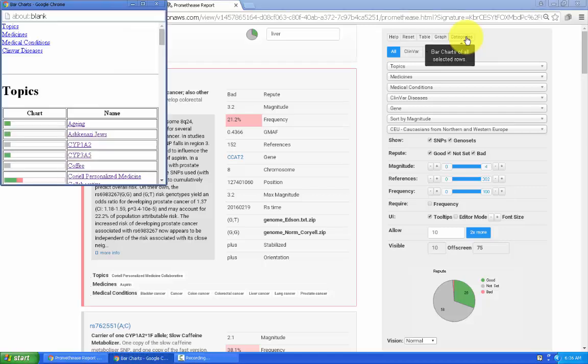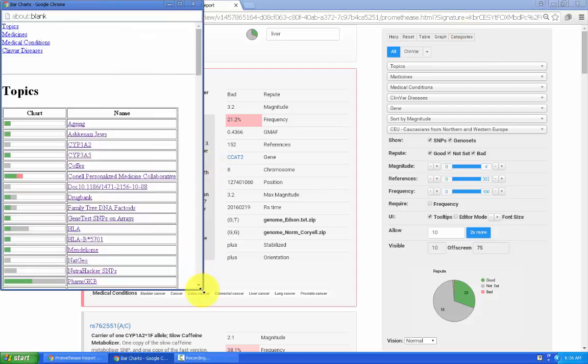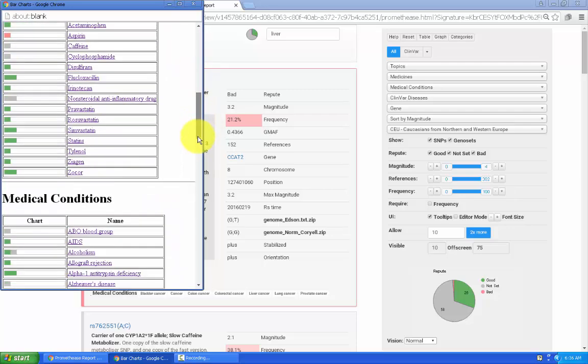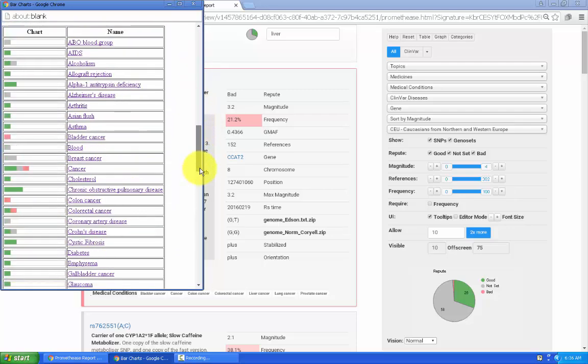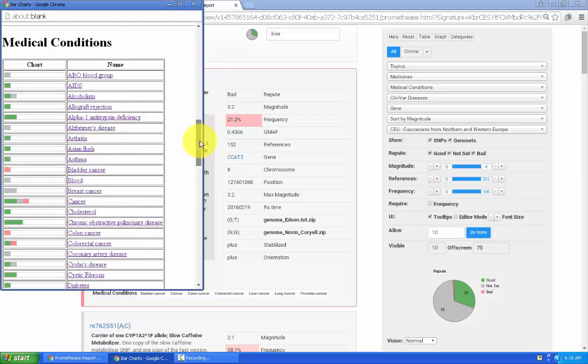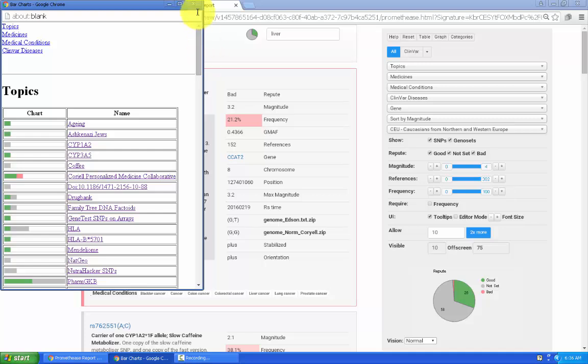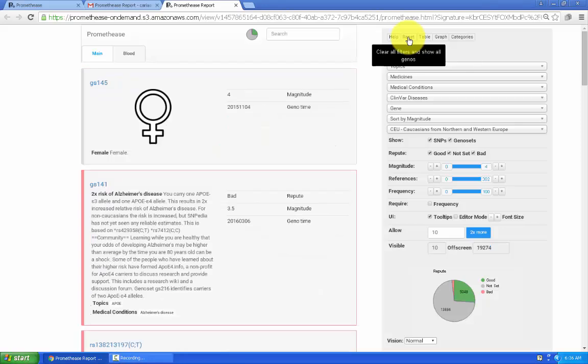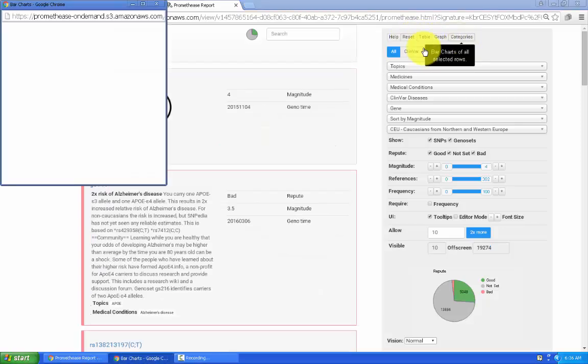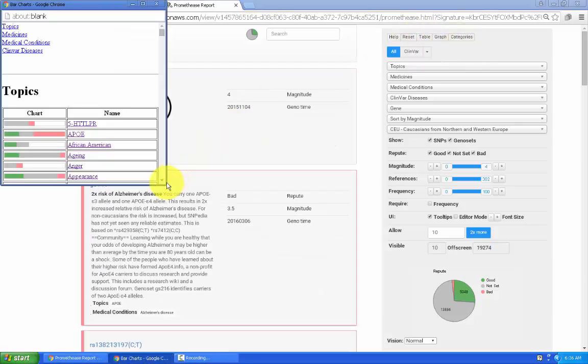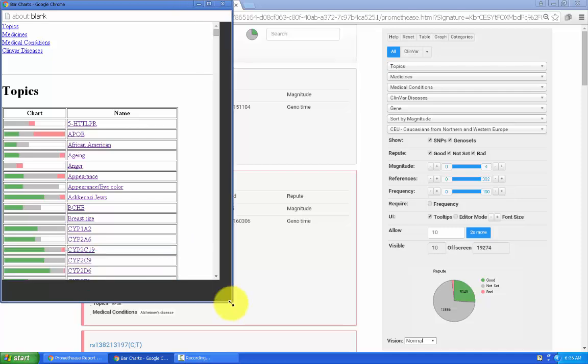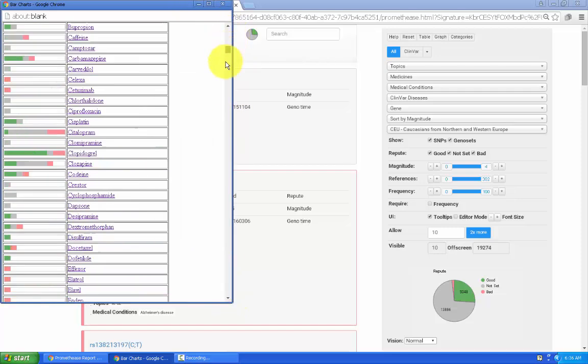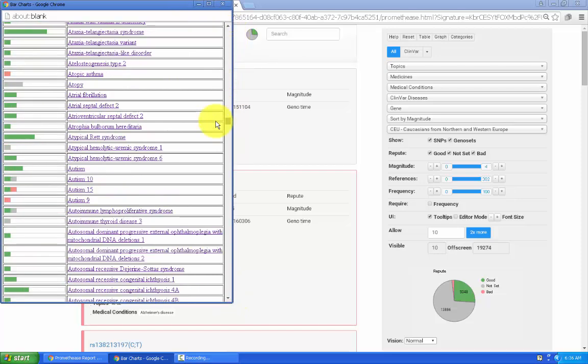Clicking on categories gives us a list of some of the different categories of information as they can be grouped. Clicking on reset gets rid of all the filters. Previously, we had the word liver selected and it was a smaller list. Now, after having hit reset, you can see a much larger list.